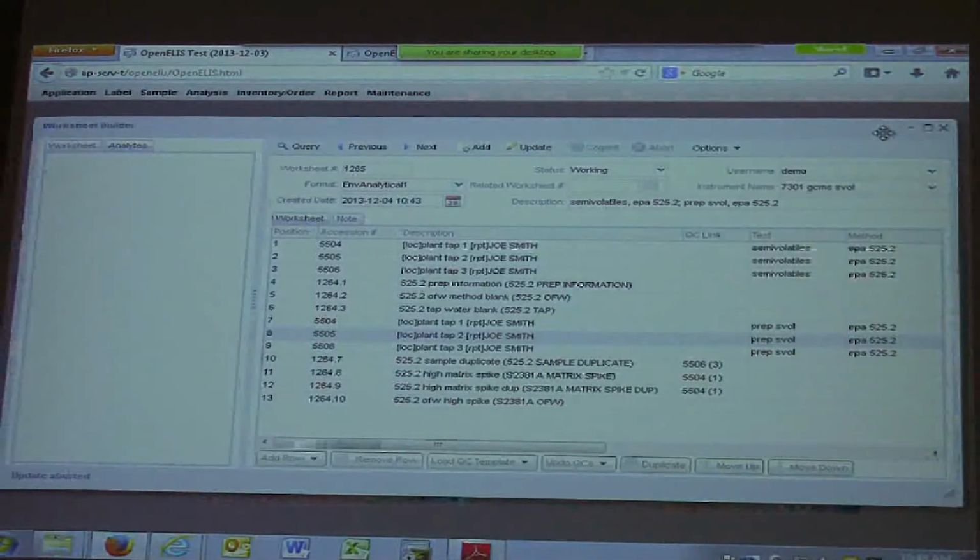One comment I want to make is that if you go and delete a row and the instrument interfacing has loaded the data into those rows, you're going to lose that data. If you delete it and insert a row just like it, you're still going to lose the data, because the data was with what you deleted.